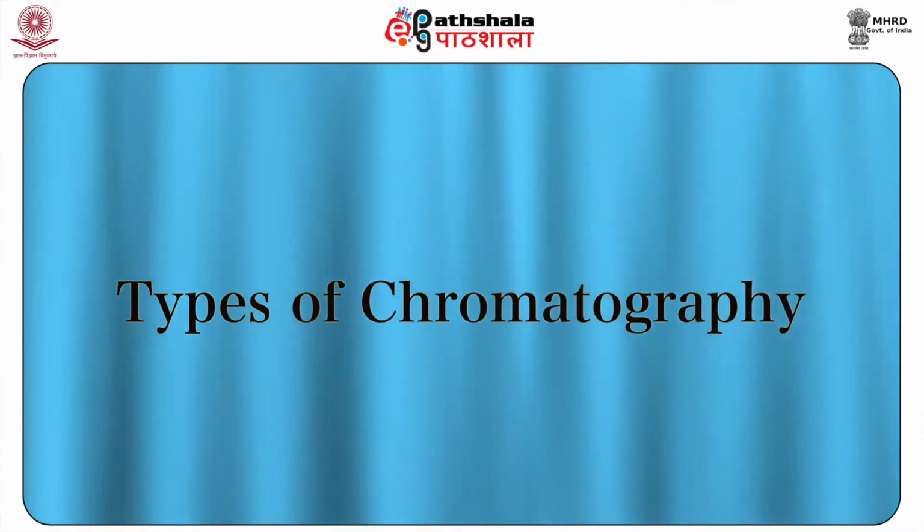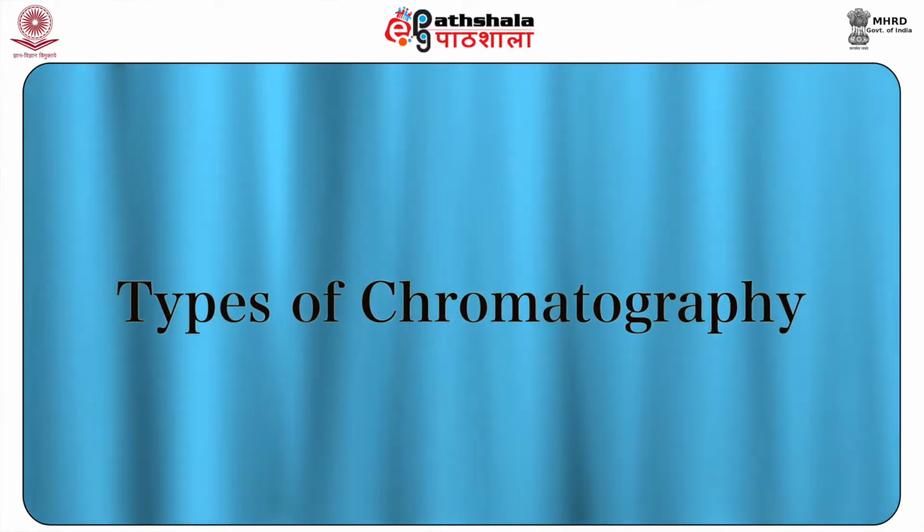Now, let us study about the types of chromatography.